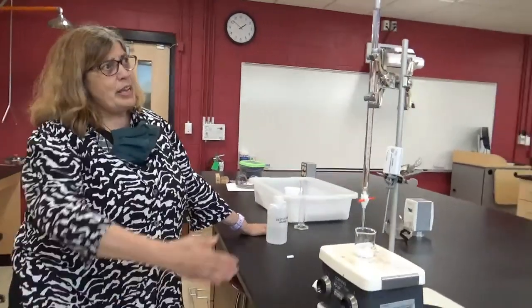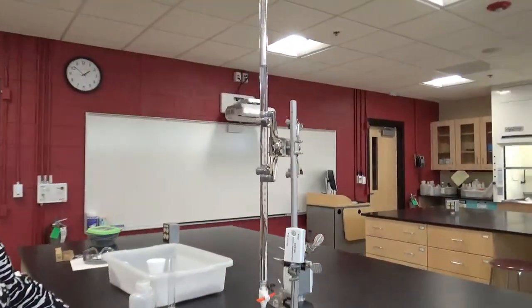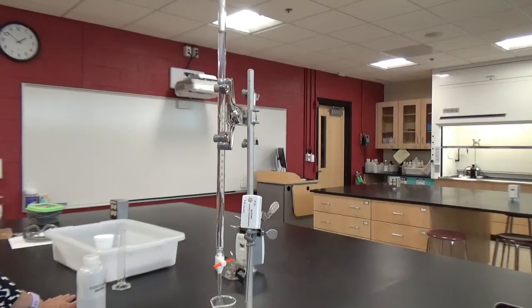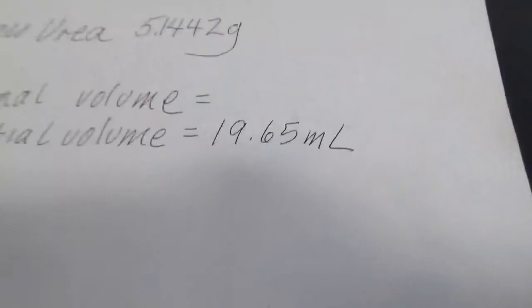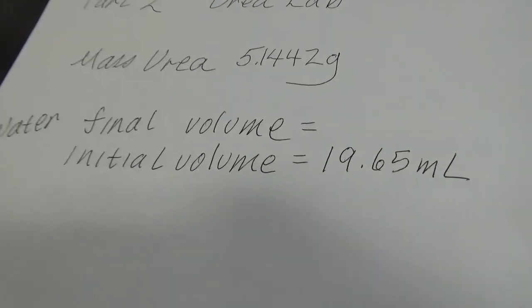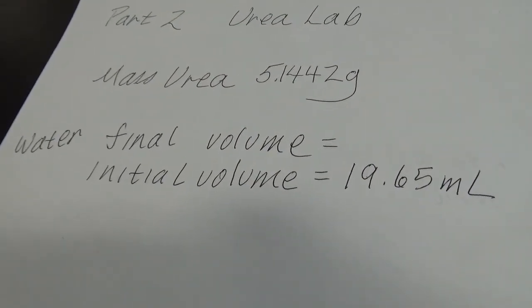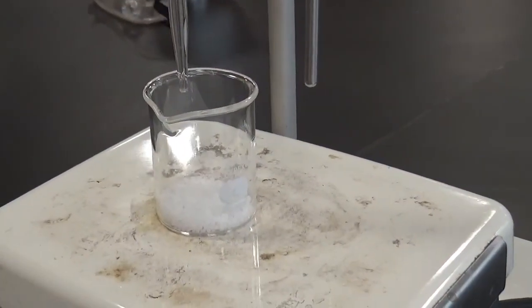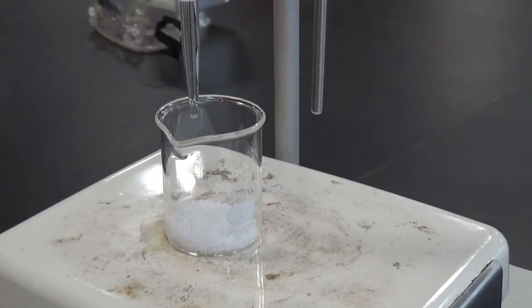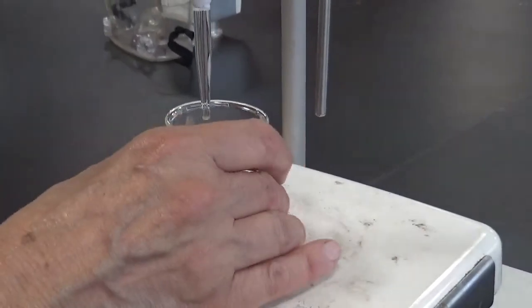So what we have here is a burette. And I've measured the initial volume as, what was it again? Oh, we wrote it down. It was 19.65 milliliters. That's the initial value of the water. And I have the weighed out urea, the 5.1442 grams in there. Actually, I may have forgotten to flow the water through the tip. So I think I'm going to do that. And I'll have to retake that initial volume. Sorry about that.